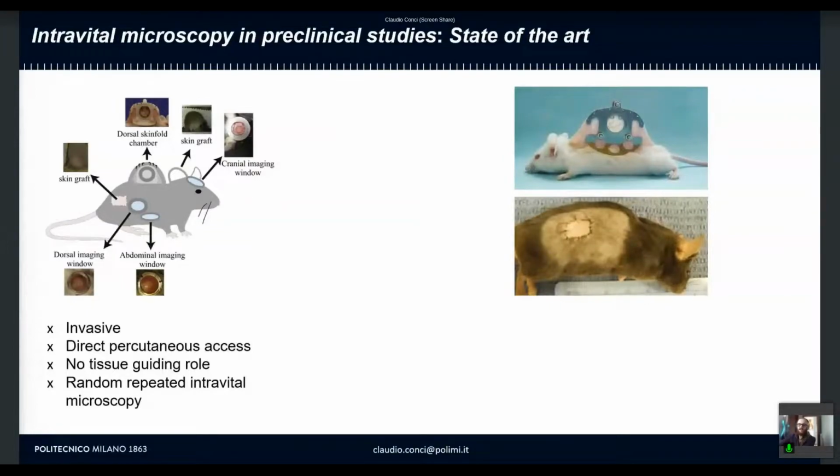So in this context, to optimize the validation procedure and at the same time to reduce the real cost of approval of, for example, new biomaterials, drugs or vaccines, several attempts were made to introduce intravital microscopy techniques as a standard protocol to quantify the subcutaneous inflammatory reaction. This is done in terms of neovascularization rate, fibrosis as the generation of collagen type 1, and cell infiltration. Therefore, by using intravital microscopy, we can potentially study the implantation outcome in a real-time manner.